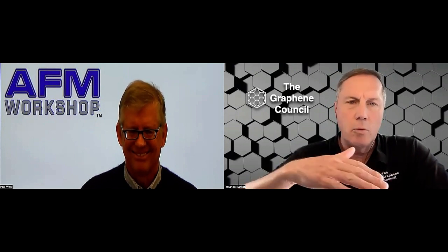Okay. Appreciate that. One of the other issues that we've come across, and this is in our discussions with institutes like the National Physical Laboratory in the UK and other experts that use this, is often graphene might be dispersed with a surfactant or some other kind of agent, then it's drop cast or spin cast. Can you talk about some of the issues with residue on it, or even with a solvent, if you dry it, there might be some residue that's left from that, and how that affects? And a broader question for me is what are the most common mistakes that people make when using this instrumentation?